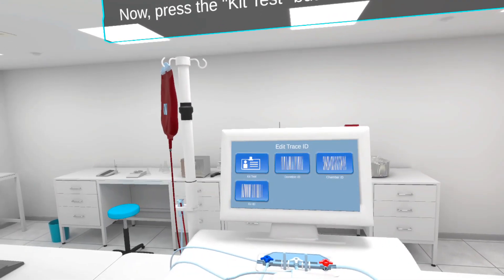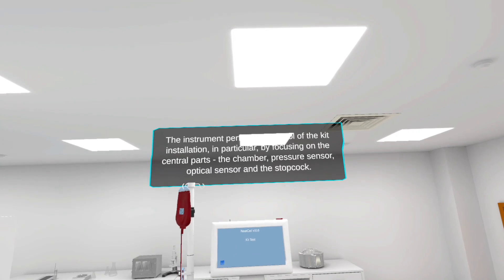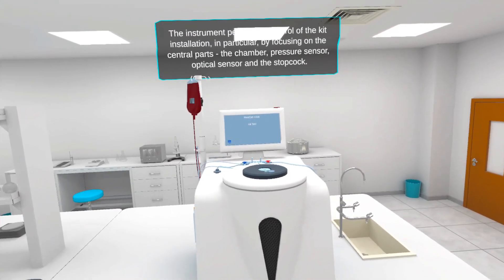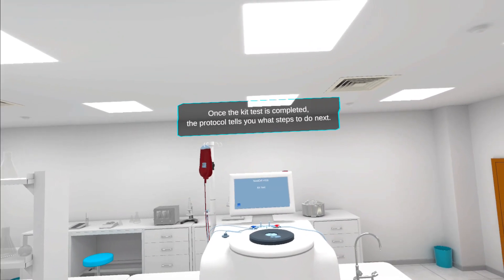Now, press the kit test button to start the kit test. The instrument performs a control of the kit installation, in particular by focusing on the central parts: the chamber, pressure sensor, optical sensor, and the stopcock. Once the kit test is completed, the protocol tells you what steps to do next.